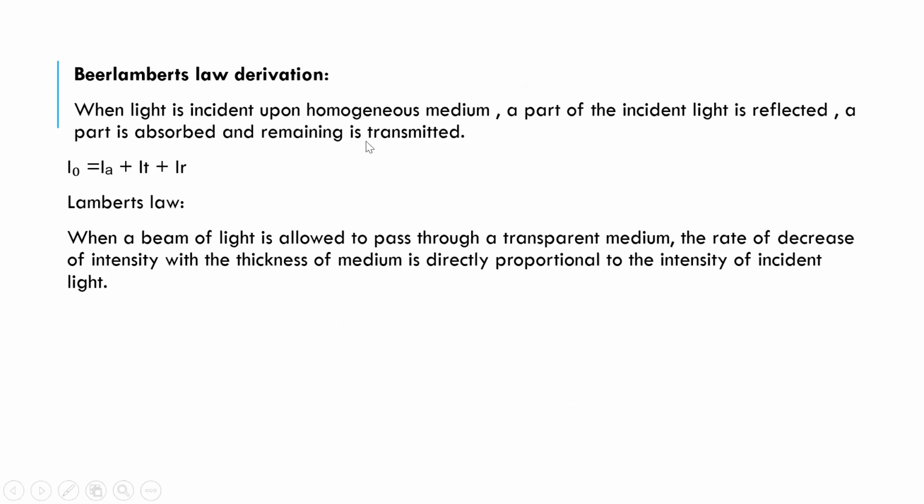Beer-Lambert's law. So what is Lambert's law? We'll discuss Lambert's law, Beer's law, and their combination. The combination of Lambert's and Beer's law is known as the Beer-Lambert's law. And then deviations from the Beer-Lambert's law.